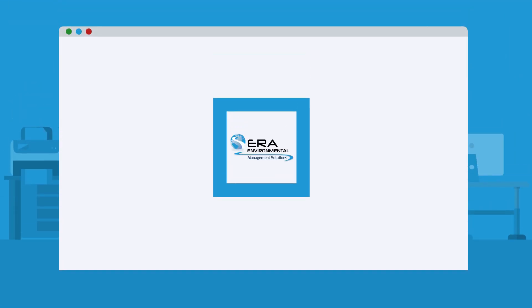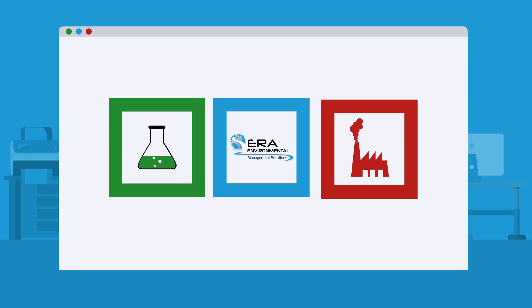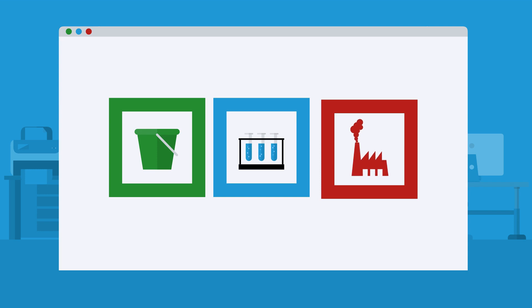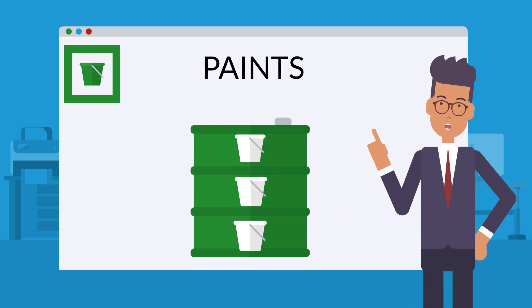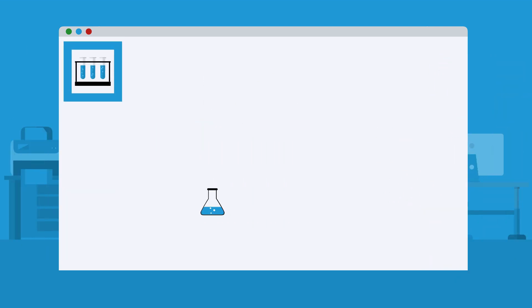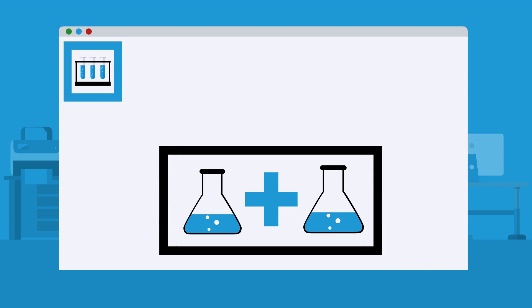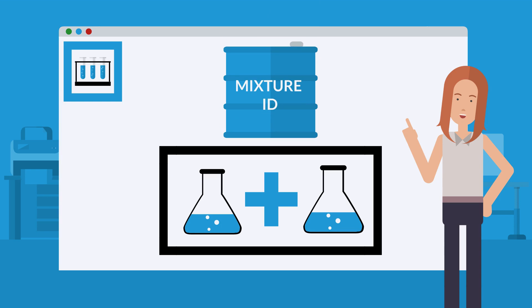ERA's system has also developed additional functions to manipulate and ease the transfer of chemicals or products within a facility, including creating kits, mixtures, or cuts. This record can create a kit by adding multiple products into a single container, like when we add paints and solvents to a single container. Create a mixture by combining two or more chemicals together — this is where our new blend will be given a unique mixture ID that can then be added to a container.